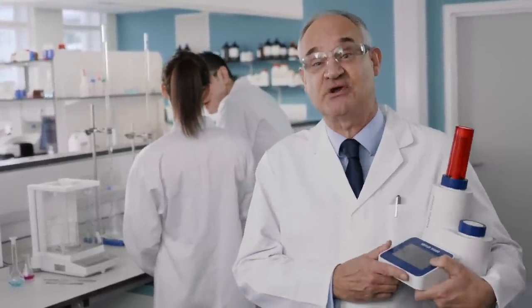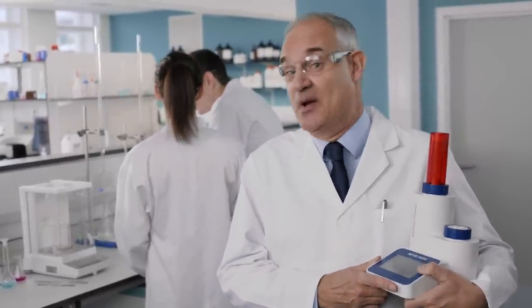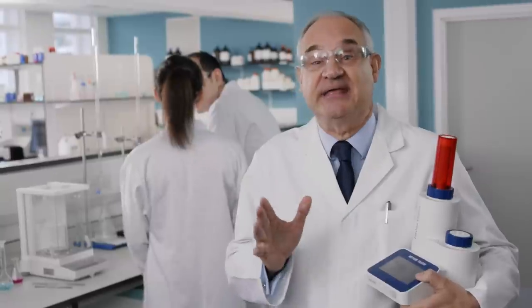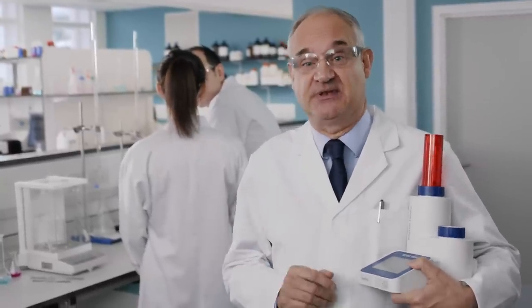You may think that manual titration is the cheaper option, but when you consider how much time and money is lost due to inexact measurement, you understand why I chose to buy an automated titrator.